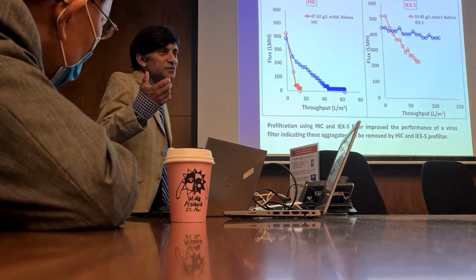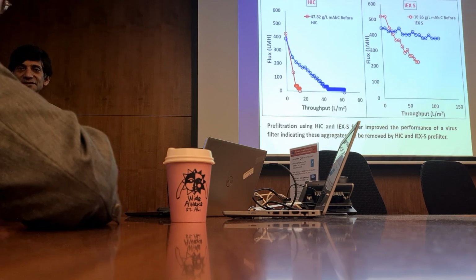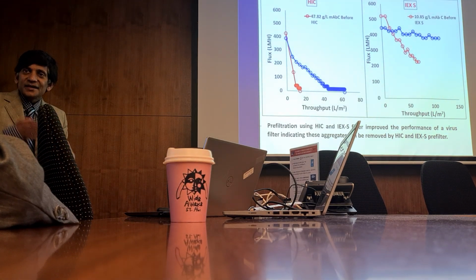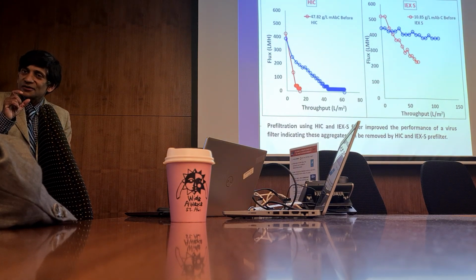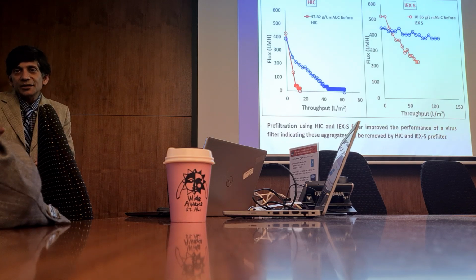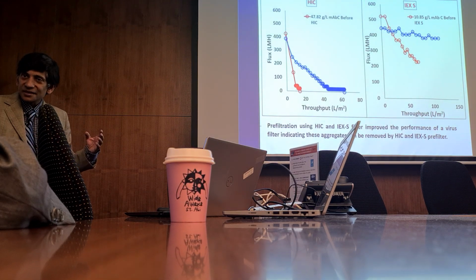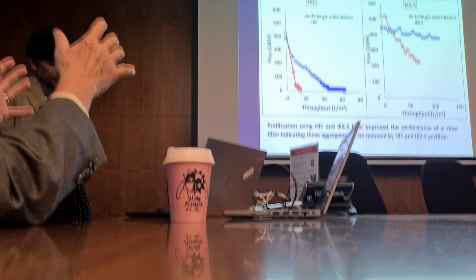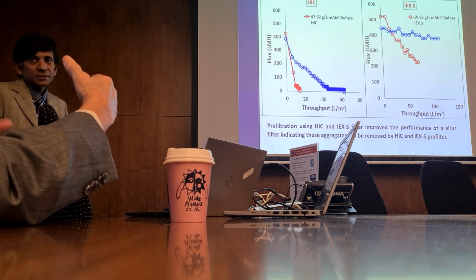There are two other things. I was telling you about cell therapy. People are looking at personalized medicine, where you take your own cells, grow them somehow, and use them to treat cancers and other diseases. Then you're talking about very small volumes, whereas this is still relatively large scale compared to that. You're talking about 10,000 liters or sometimes more in these applications. For the larger scale, for practical application, how do you deal with the volume problem?